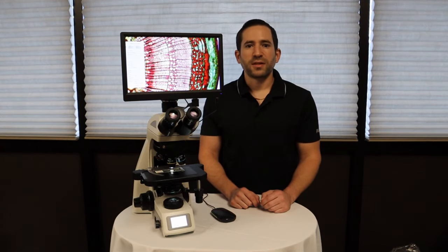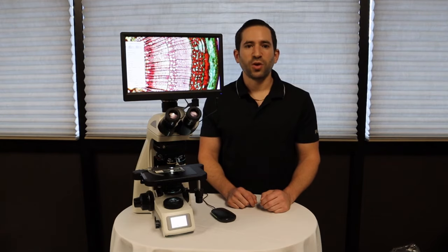Lastly, this camera outputs via Wi-Fi to an iOS, Android, or even PC, so you can wirelessly share and capture images on the go.